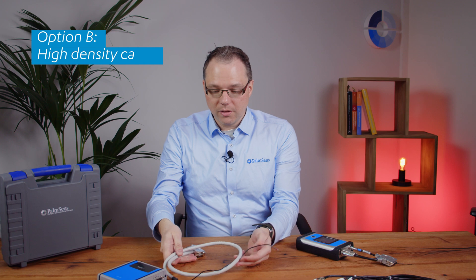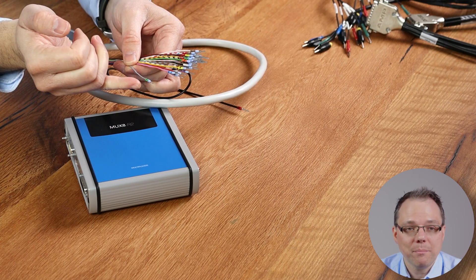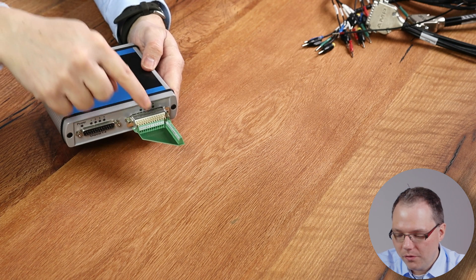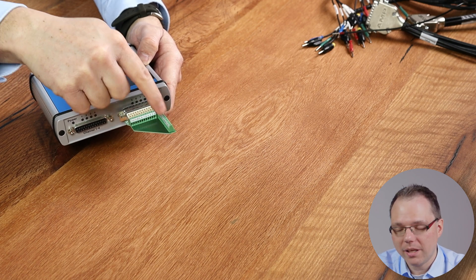Let me show you other cable connection options. We have a standard cable from electronic suppliers — this is a high-density cable where each pin of the plug is pulled out into a single lead that has a number, which is the pin number, and then you have a ferrule at the end so it's easy to solder this cable to something. This is more recommended if you want to make your own setup. Another good solution for making your own setup are our screw terminal connectors. These are very small and make it easy for you to organize your own connections. You have all these little screw terminals — you can screw them open, put a cable in, screw them tight again, and every pin has a screw terminal. You will find the pin-outs in the manual so it's easy to arrange them.